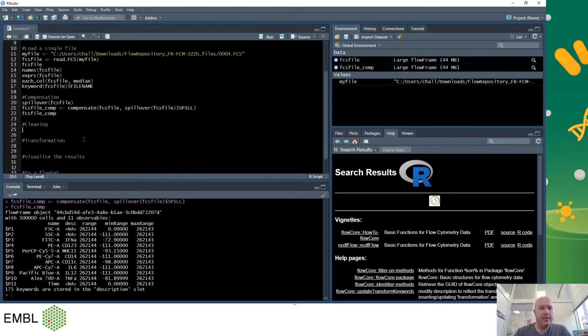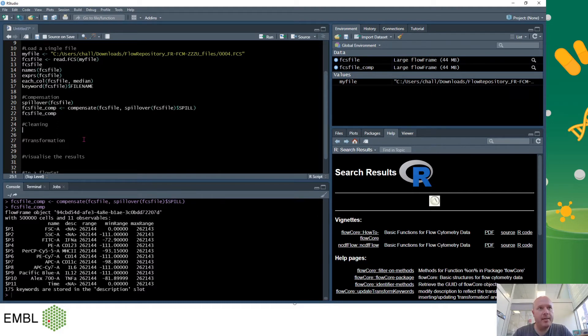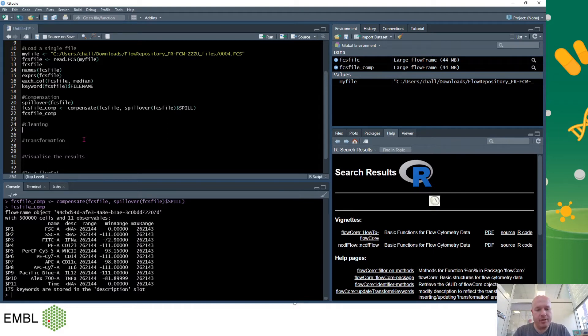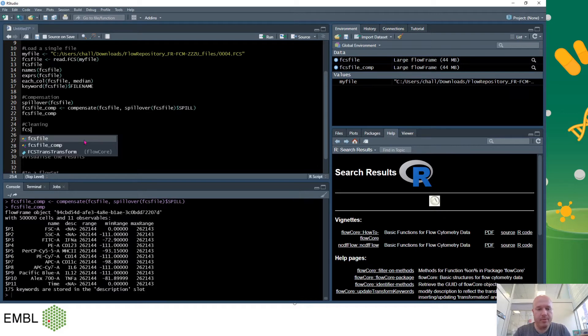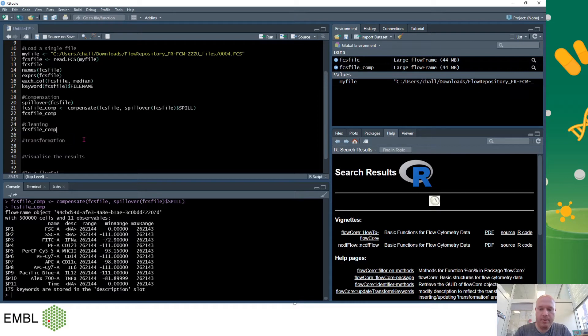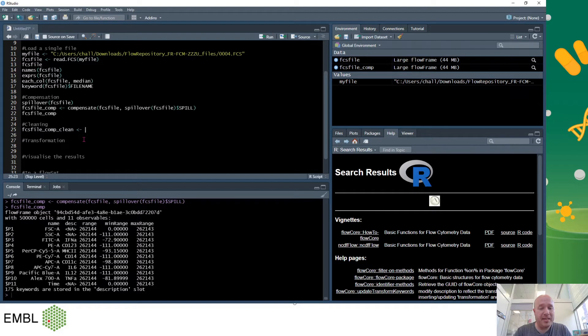Cleaning. So next we want to clean the data. To clean the data we'll be using a package called FlowAI which is very easy to use. It has this great command called AutoQC. So again I'll create a new variable called FCS file comp clean. It's very important to give all the variables sensible names. I'll be using the AutoQC.